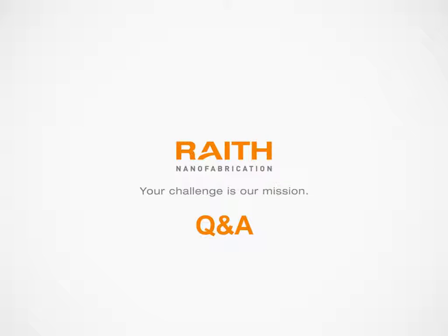Okay, thanks, Jason. Next question. What type of SEM was used in the work that you described in your talk, and also what is your definition of high resolution SEM?